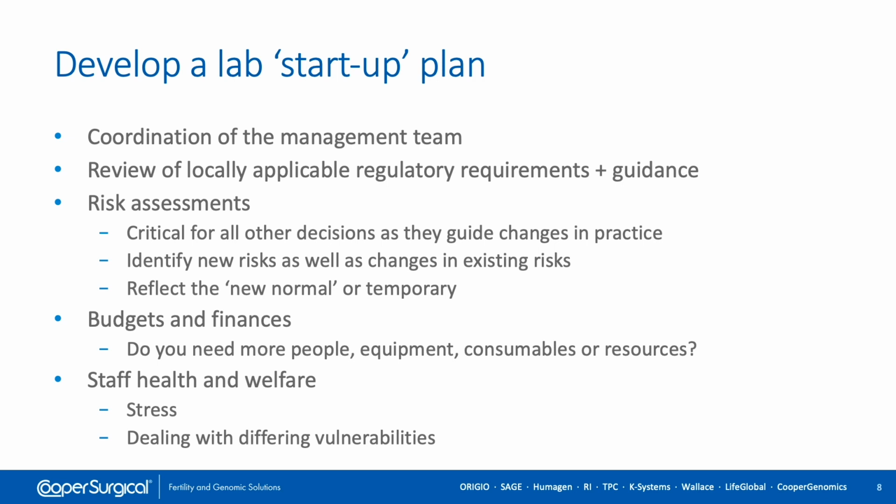In determining what changes are necessary, no doubt the plan will identify extra resources, whether people, equipment, or consumables, such as personal protective equipment, that may require extra funding. An additional factor that must be considered is that of staff health and welfare. Many people may welcome the chance to return to work, but we must recognise that this can also be a stressful time for them. Staff with relatives at higher risk, should they contract COVID-19, may be fearful of acting as a vector for the virus, and consideration also needs to be given to more vulnerable staff, such as those with asthma.